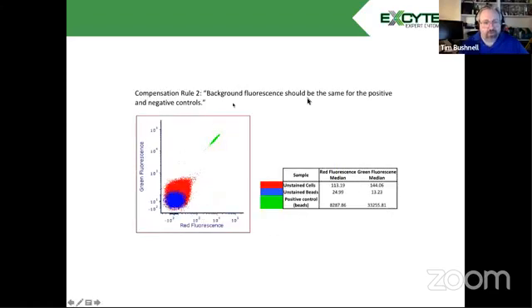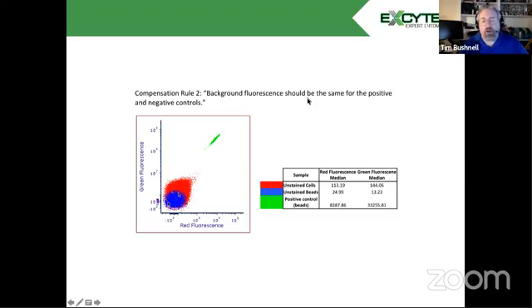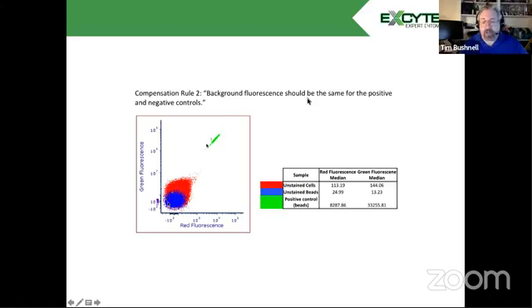The second rule is the fluorescent background needs to be the same for the positive and negative controls. And here we see our positive beads in green, our unstained cells in red, and our unstained beads in blue. And you can see that these two have very different autofluorescence, background fluorescence. So we need to make sure that whatever the fluorescence of this, which was on beads and the background fluorescence of our negative control, are the same. Otherwise, we're going to improperly compensate. We can slightly over or under compensate.